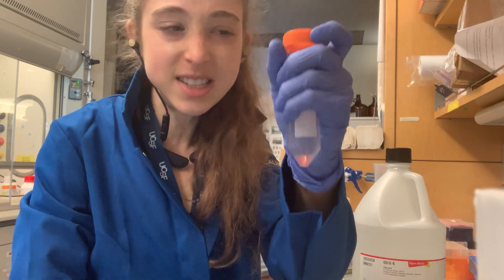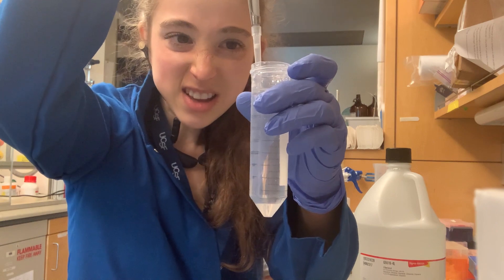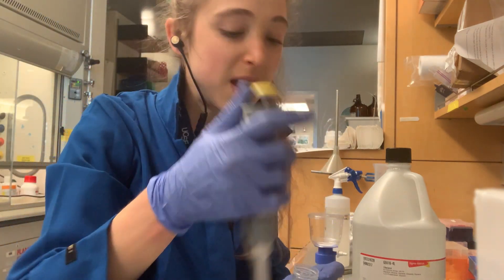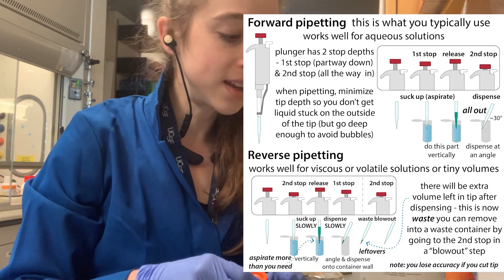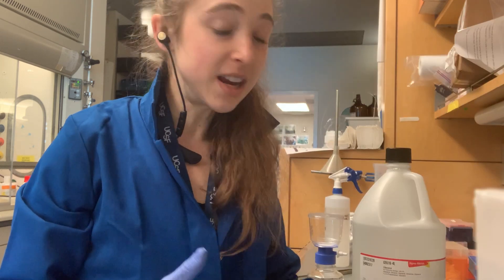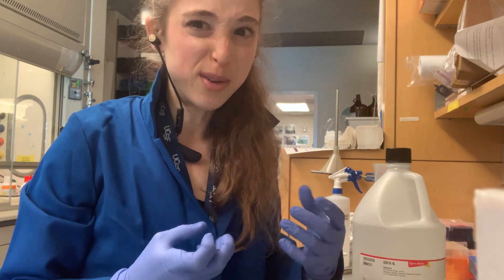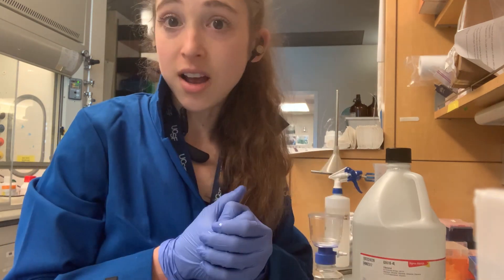It's extremely viscous, so if you were to try to pipette 100% glycerol you'd have problems — you can see it sucks up and all sorts of weird stuff. Yesterday I talked about some techniques like reverse pipetting to help with viscous solutions, but really the best thing is just to avoid the super viscous ones by making an 80% glycerol stock. This lets you avoid the gunkiness while still getting the benefits of glycerol.